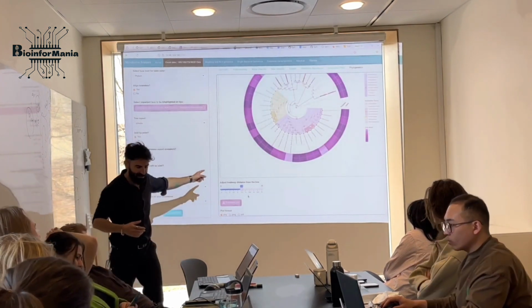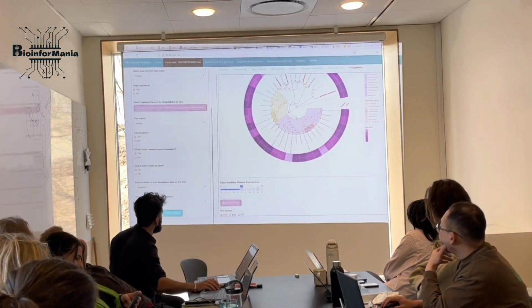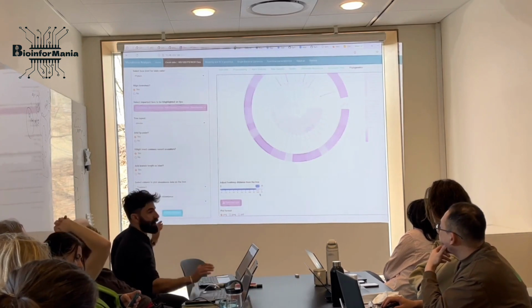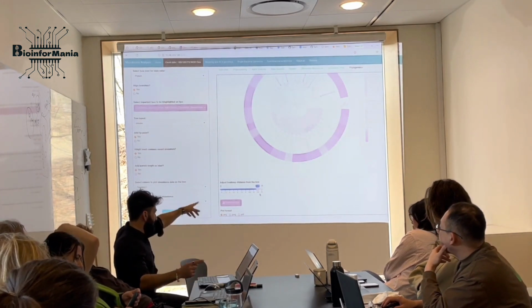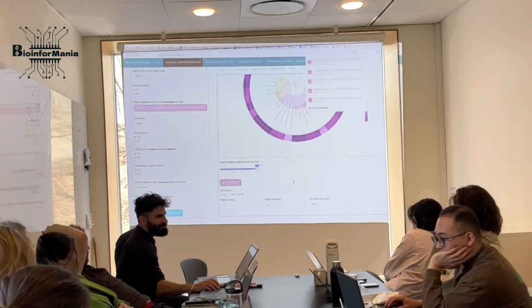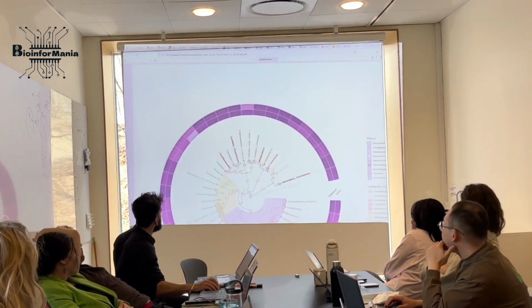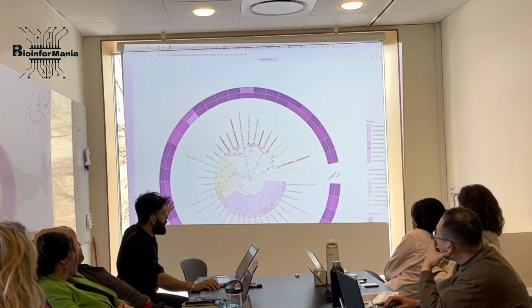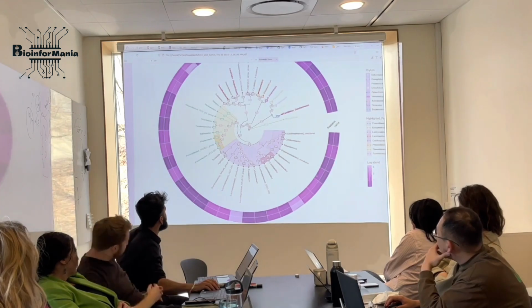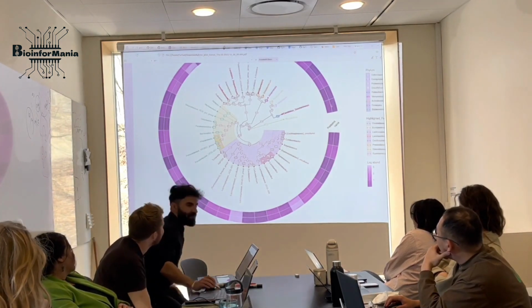Yes, that's why, I remember I had an issue when I was downloading it. That's why I added this function to it. Let's go a little bit higher. If you have long names, like for species, increase this as much as you can, okay? And then let's download it. There we go. Actually, it's readable, those numbers. But still increase it. I mean, the limit is the CPU, not the sky. But you get the point, right?